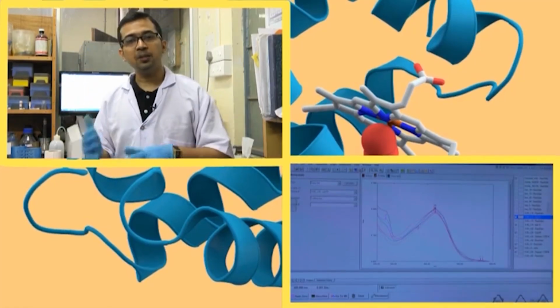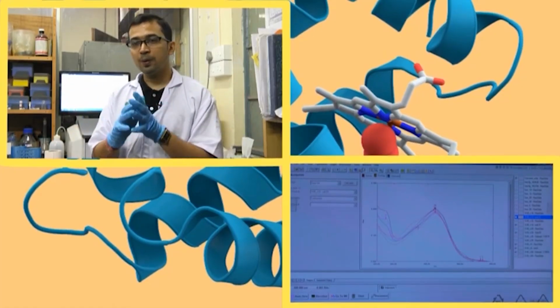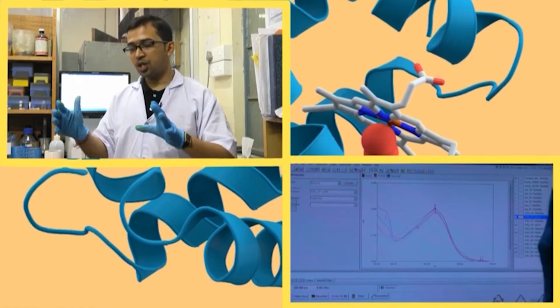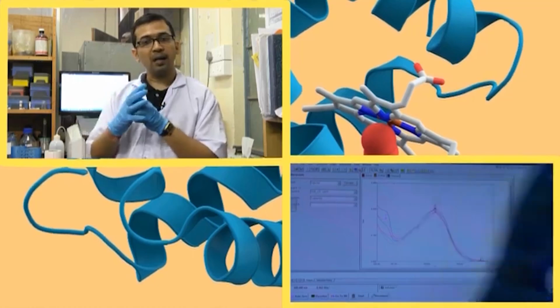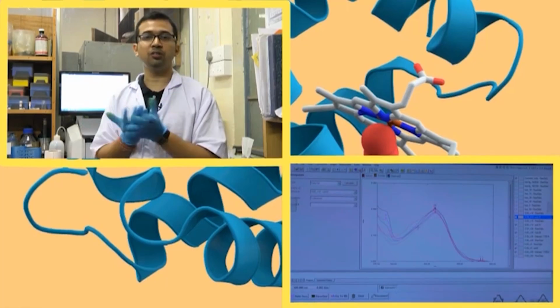On the other hand, something else might happen. Okay. So, when curcumin is getting attached with HSA, what is happening? I am explaining this for those curcumin which were initially soluble. When it is initially soluble, we have added HSA to it. So, what is happening? Those solubilized curcumin are coming in contact with HSA, and when it is coming in contact with HSA, its exposure to the solution is decreasing.